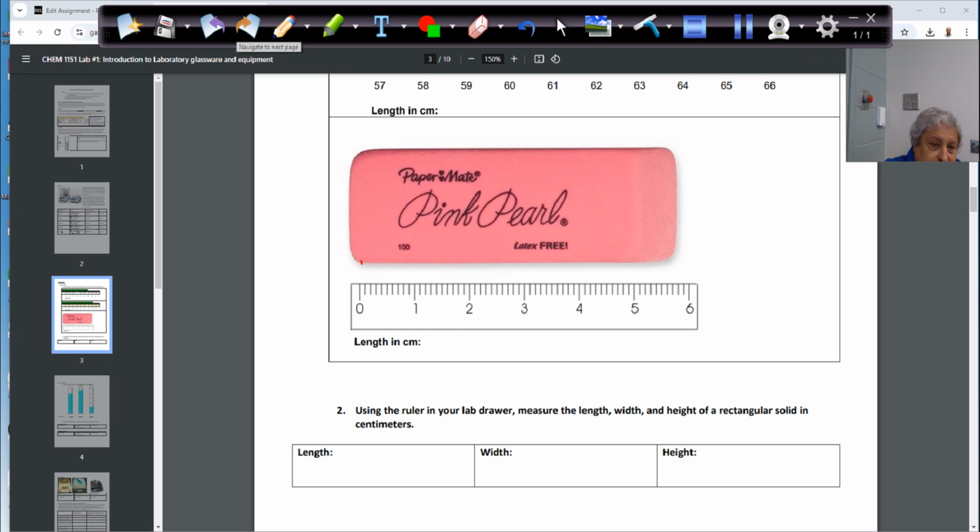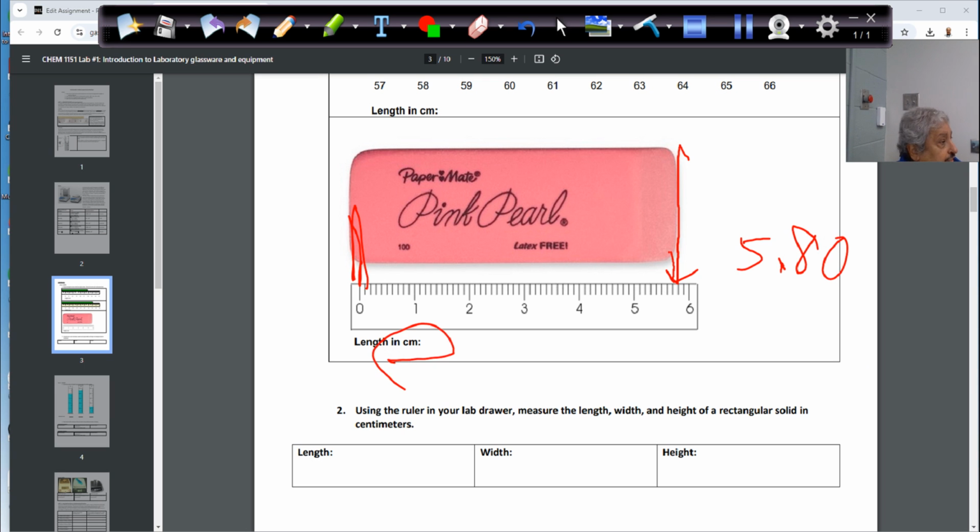So this is your 0 here. Start from here. This is your 0 up to here, correct? So with the help of the ruler, you can pinpoint where the point is. It's of course 5, correct? 5 point, and then you can count each subdivision is 0.1, correct? 5.1, 2, 3, 4, 5, 6, 7. Yeah, I would say 8. And this is the unit in centimeter, correct, guys?